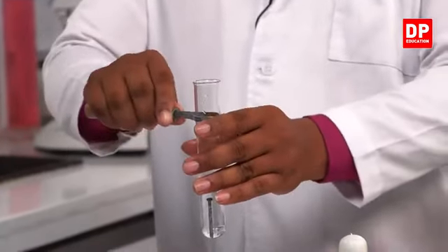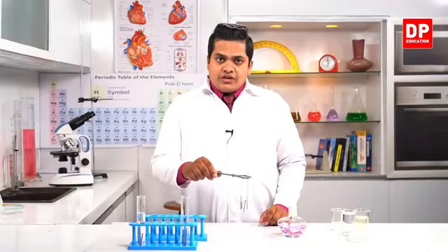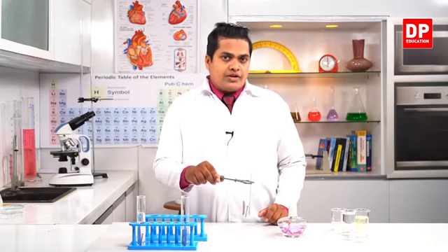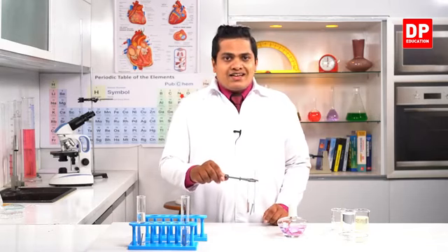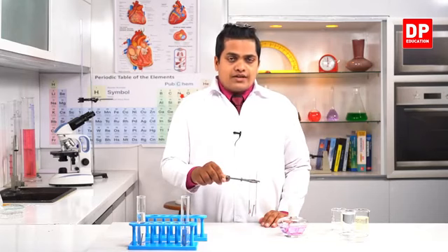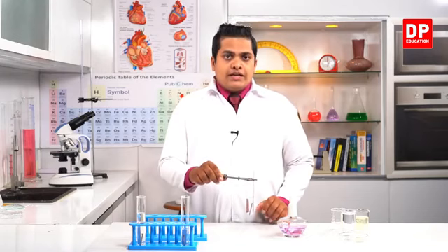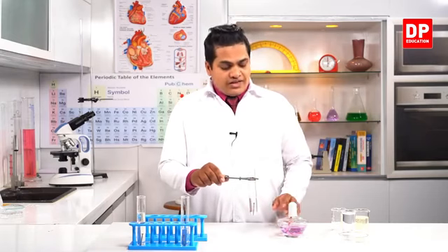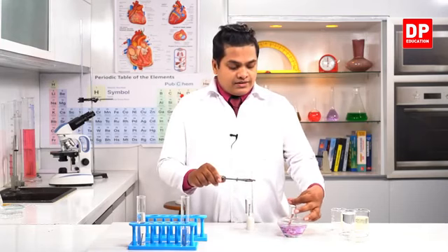So what's the purpose of boiling water? The purpose of boiling water is that we need to expel all the gases which are already dissolved inside the normal water. You know that gases like oxygen and carbon dioxide slightly dissolve in water. So to expel all the gases contained in water, I am going to boil it very well. When you are boiling water, the gases which are already dissolved inside the water are going to evaporate.